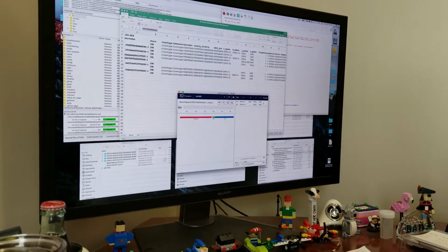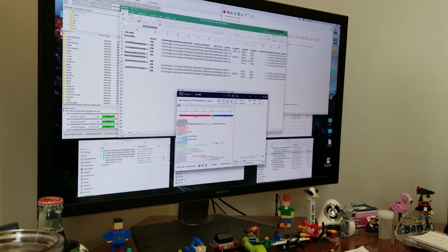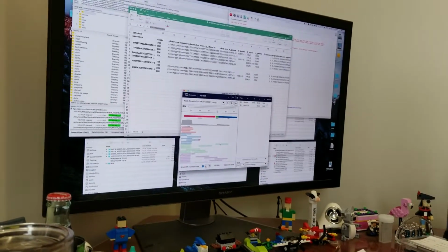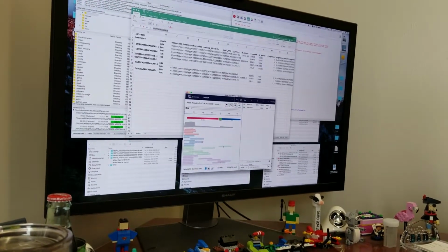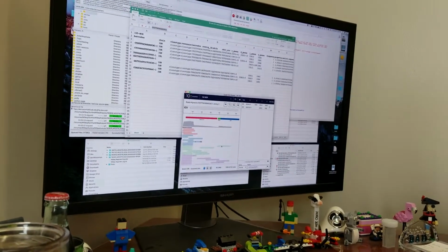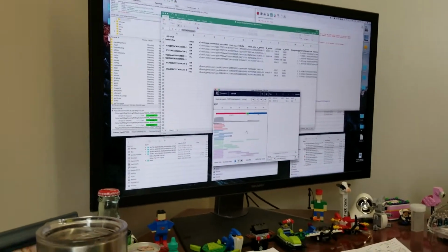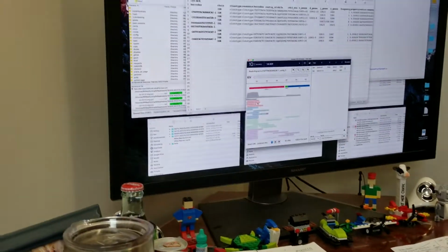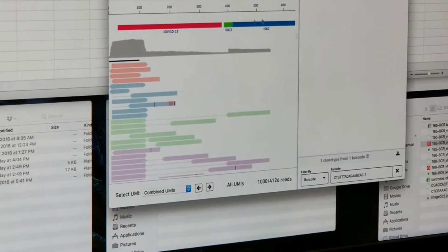And so let me make this a bigger screen. Did it say upload BAM file? It asked where the BAM file is located, and so I just went and pointed to where my BAM file is. Yours, I just uploaded this morning to Box into that folder that has the vloop file. And so now this shows the reads, all these little different colored rectangles with arrows. Oh, I see. Those are the actual reads aligning to this sequence.